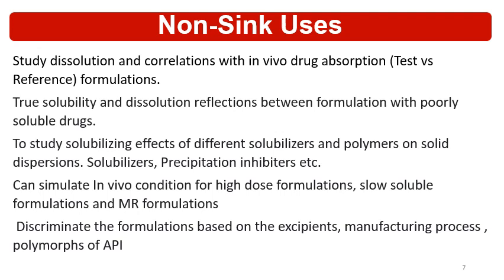Non-sink conditions for dissolution testing are used to study dissolution and correlation with in vivo absorption. Suppose you have the reference and test formulation in your hand and you want to study the exact behavior of the reference and test, then non-sink condition can be very useful. This condition can give a clear indication whether the reference product is showing higher solubility and higher dissolution rate than the test formulation, and based on that you can understand the true solubility and dissolution reflection between the test and reference formulation, and between formulations with poorly soluble drugs.